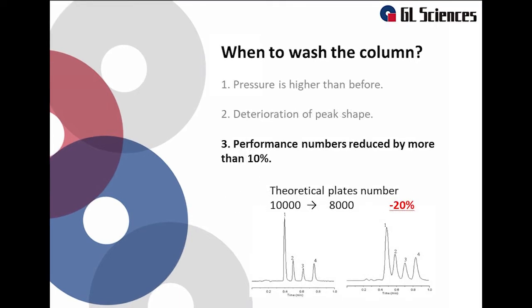The third case is when the theoretical plate number decreased by 10% or more. If the column becomes dirty, noise may increase or the peak shape may deteriorate. As a result, the theoretical plate number will gradually decrease.